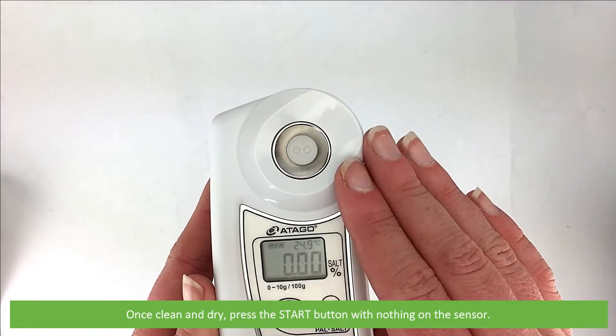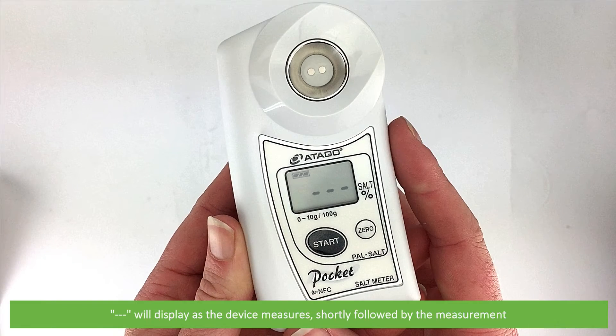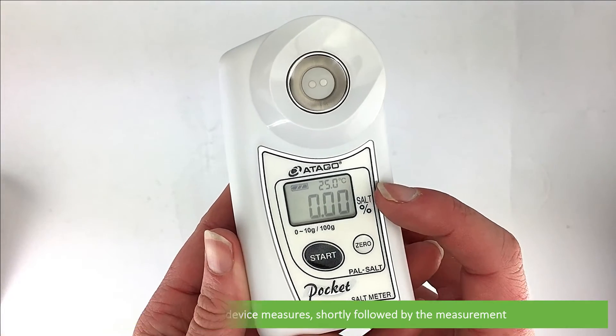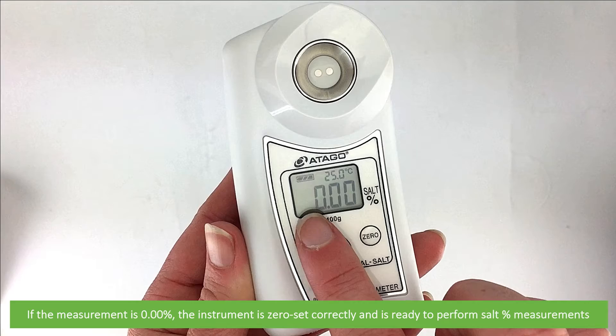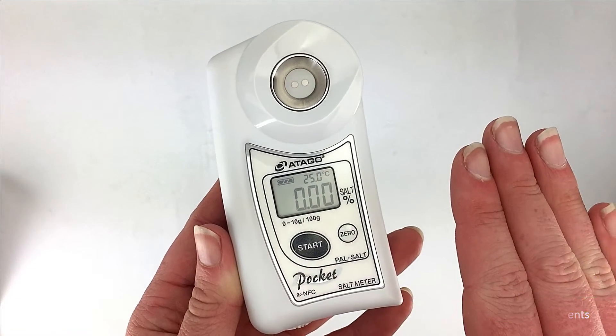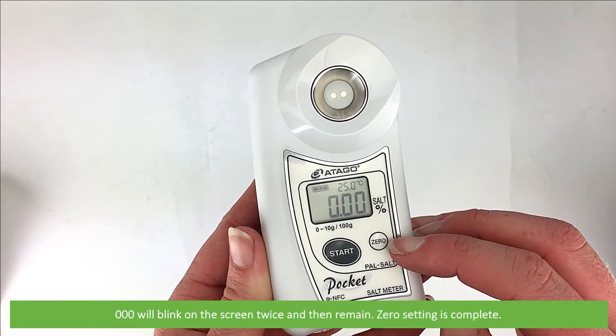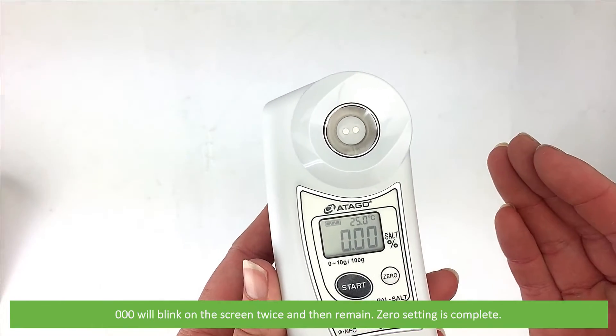Once clean and dry, press the start button with nothing on the sensor. Three dashes will appear as the device measures, shortly followed by the measurement. If the measurement is 0.00, the instrument is zero set correctly and it's ready to perform salt percentage measurements. If the device is reading above zero, press the zero key. Triple zero will blink on the screen twice and then remain. Zero setting is complete.